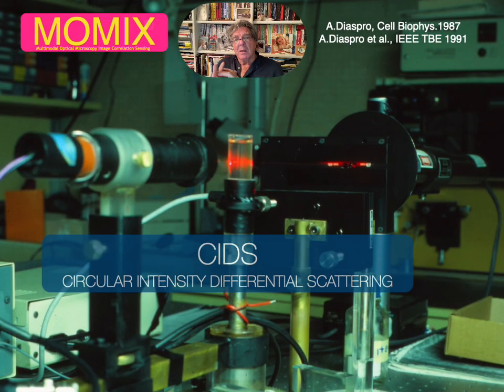But now, before ending, it is time to bring to your attention label free. Why? Because when the environment is crowded, I'm quite sure that you have in mind that if you add molecules, you increase the crowding. And when you increase the crowding, the organization of the molecules in a crowded environment that becomes overcrowded is different. Now, at the very beginning, it's useful to keep the fluorescent molecules because they have the specificity, and to learn if you can follow changes in a crowded environment. In the future, we would like to remove the fluorescent molecule. We need, again, artificial intelligence in order to have a training in the understanding of what's going on and managing this large amount of data.